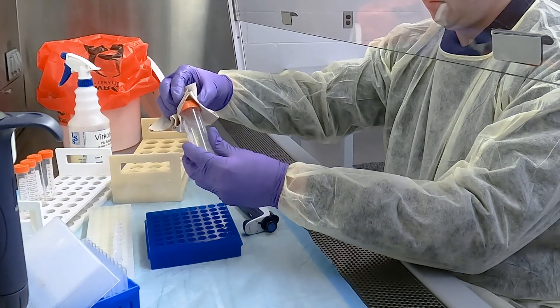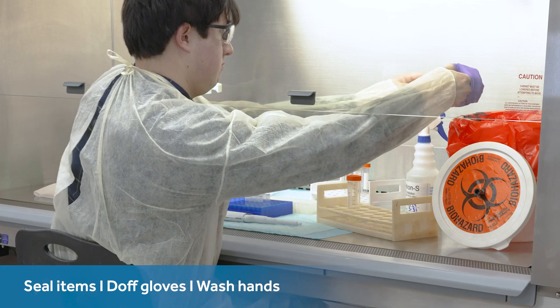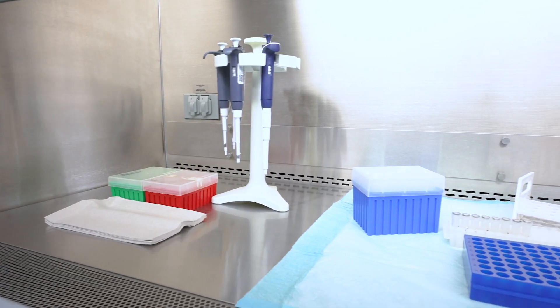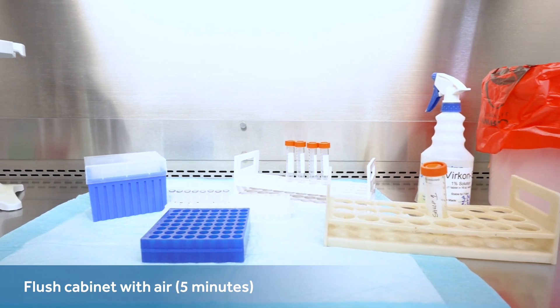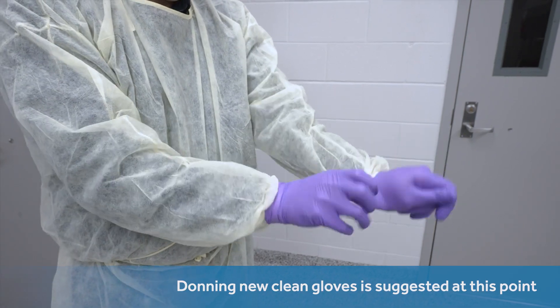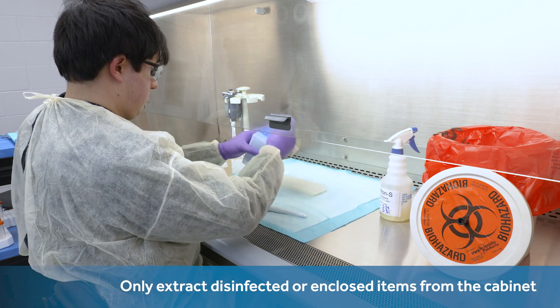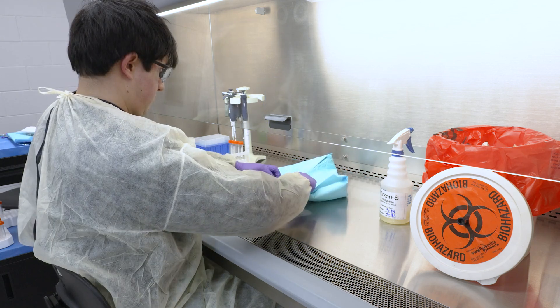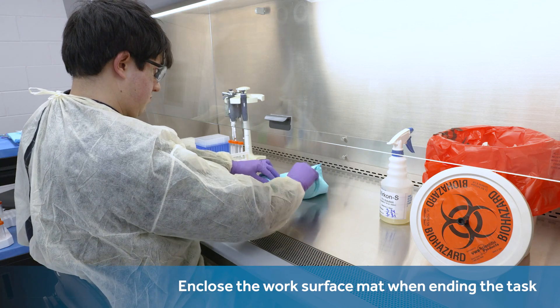As the operator brings the task to a close, their next steps are for all items to be sealed, their gloves to be doffed and enclosed in the biohazard receptacle, and their hands to be completely cleansed. Industry guidelines suggest you flush the biosafety cabinet with air by using its own motor, usually recommending a time of five minutes. Donning new clean gloves is suggested at this point. Biosafety guidelines and experts typically make superficial disinfection or enclosure a prerequisite for the extraction of anything from the cabinet. One is also advised to use the biohazard container to contain the pleated work surface mat when ending their task.